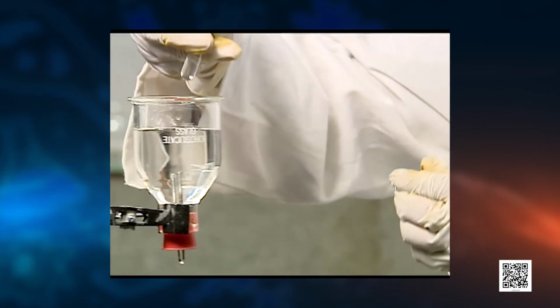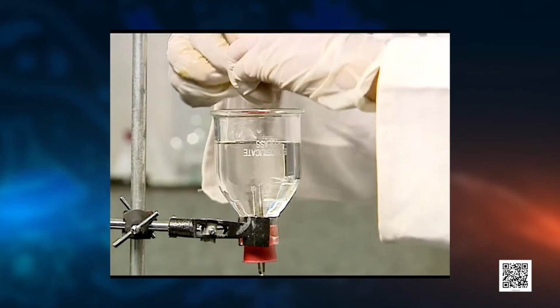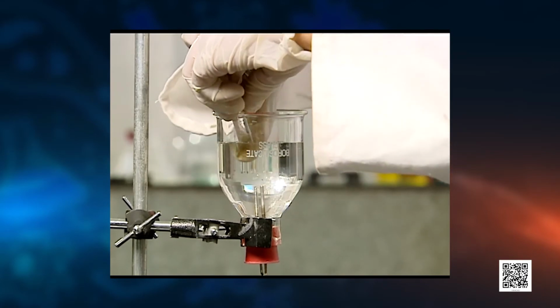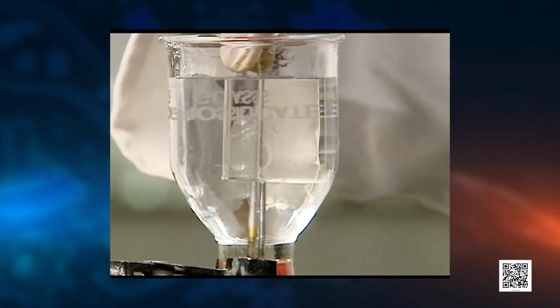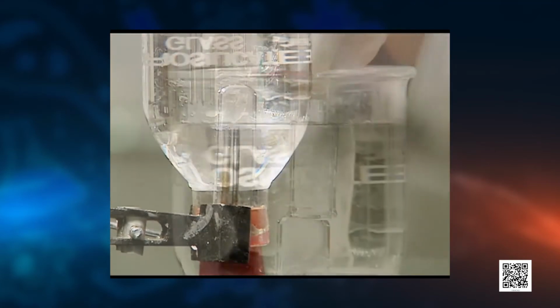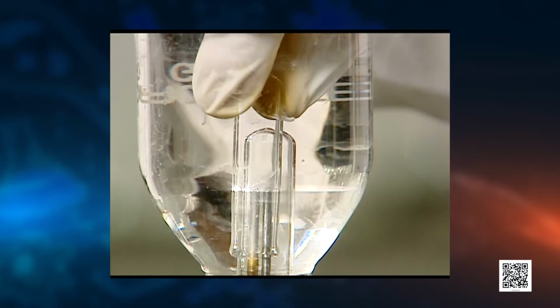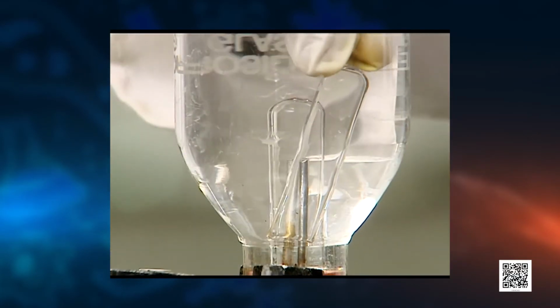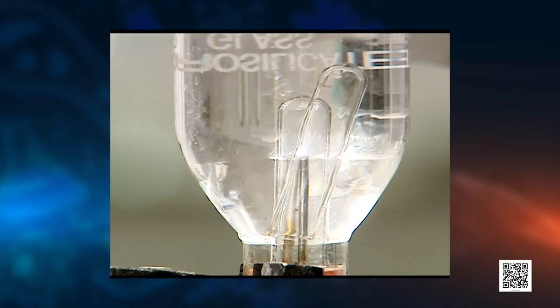2 small tubes are taken, filled with water to the brim, and we are now inverting them over the 2 carbon electrodes. When you are doing this, care has to be taken that no bubble is formed. Otherwise, we will not get to know about the exact ratio of the gases. Now both the test tubes have been placed over the electrodes.